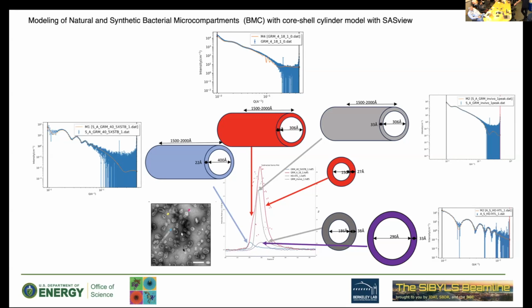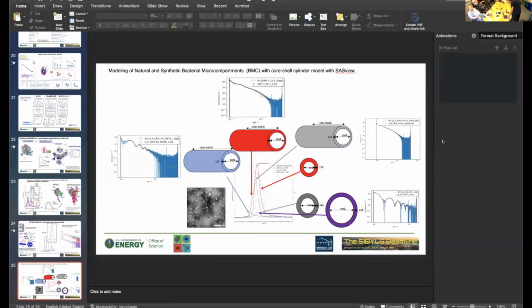That's why I should mention that we may use that. I think nobody has tried this copolymer, the lipid copolymer studies. It's still a hydrophobic, hydrophilic particle with RNA in it. So I think it's something similar to LNP. That's where the field goes, LNPs, and making cleaner data. But I think that will be the main target, large, small LNPs. Okay, so who is next?